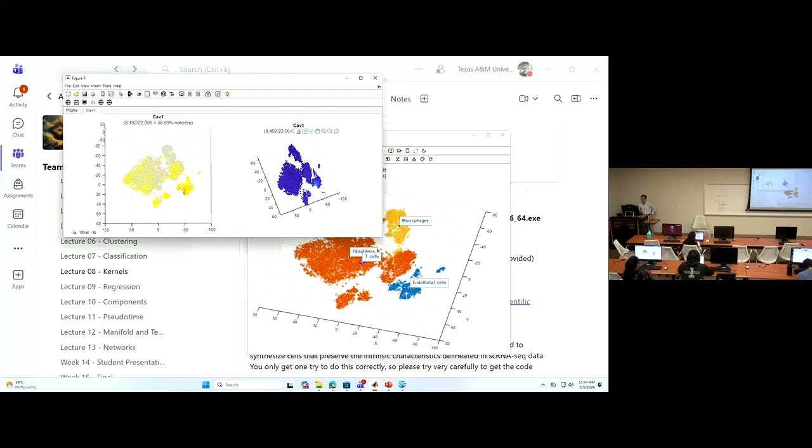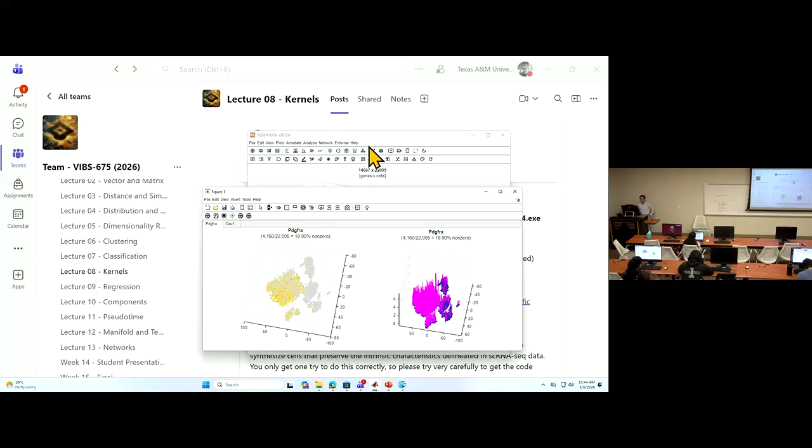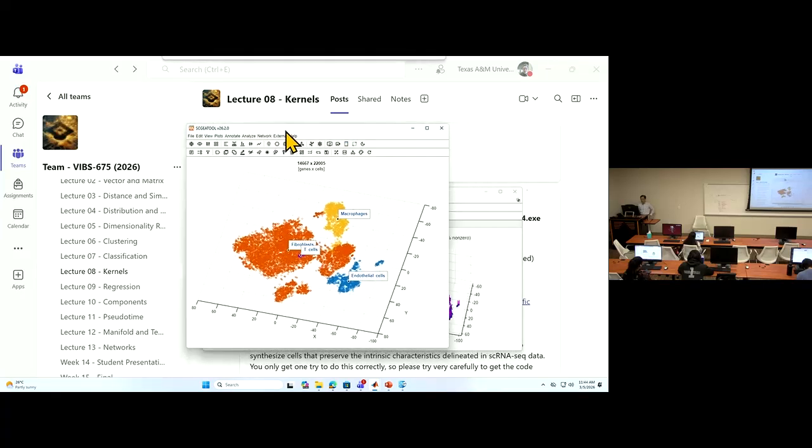And endothelium cell provides this ligand and gives it to this group of fibroblasts. Okay, so that's a signal I can see from the pairwise gene expression and the corresponding cell type.